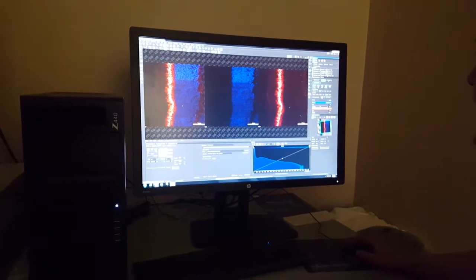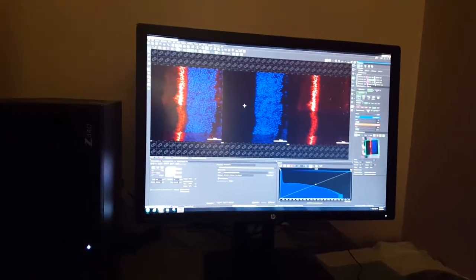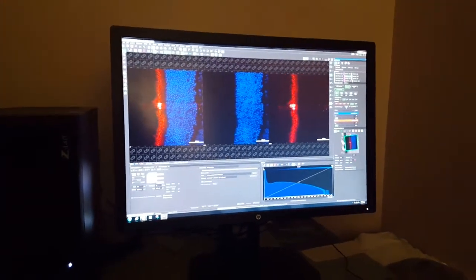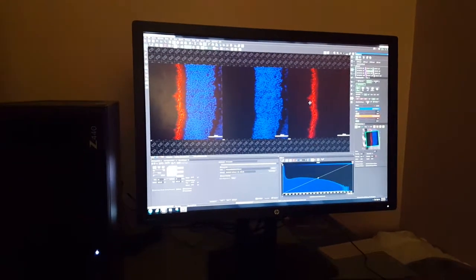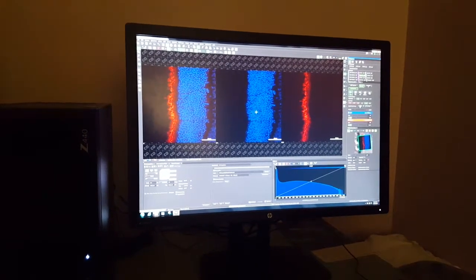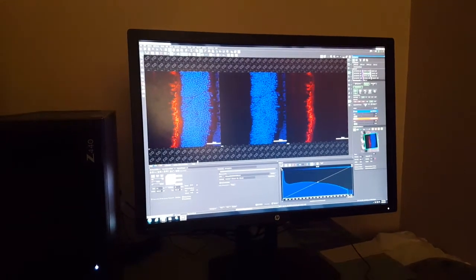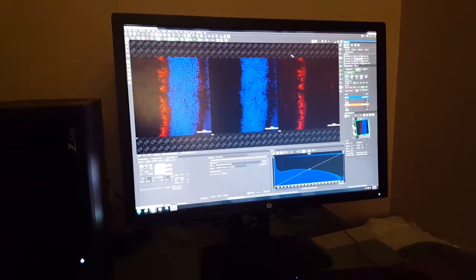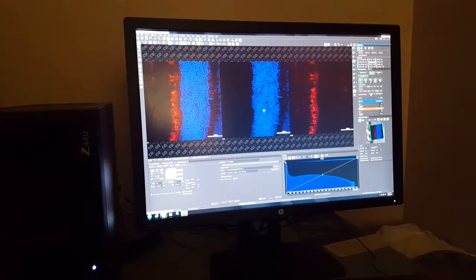I can start going down. In the moment that I'm going down, I fix it, but I have to keep going down to see what's going on, if the DAPI is going to saturate or not, for example. And I went up to the bottom. Looks good for us. We don't want more than this. And this DAPI is not saturating.